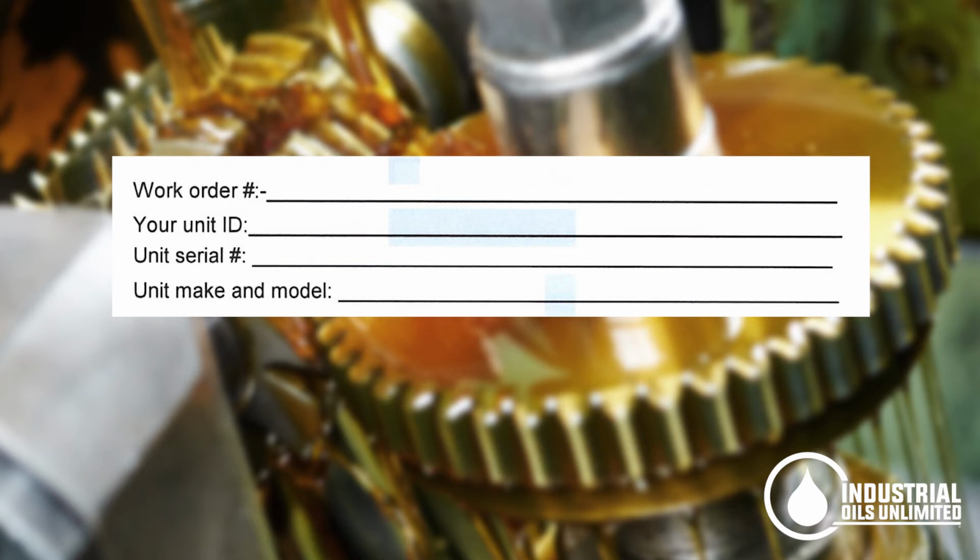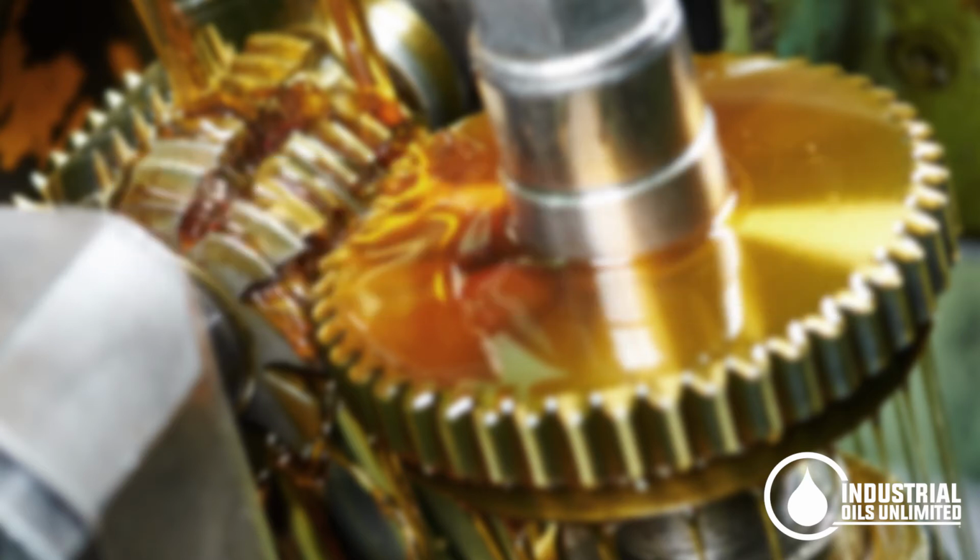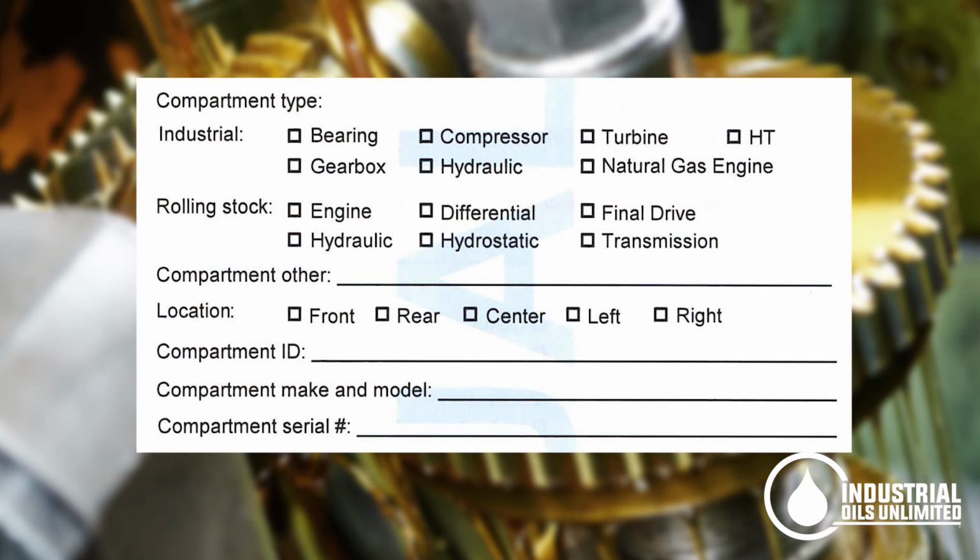Sometimes different ranges of serial numbers may use different bearings or different bearing materials, which is important for the lab to know when they're interpreting results. The next section asks for information about the compartment type. This gives important information about where the fluid sample came from, since different compartments can yield different levels of fluid purity. Compartment ID, make and model, and serial number provide further detail for the lab.